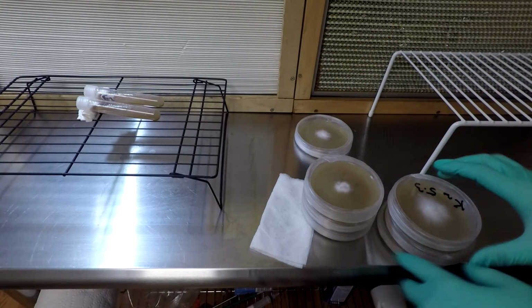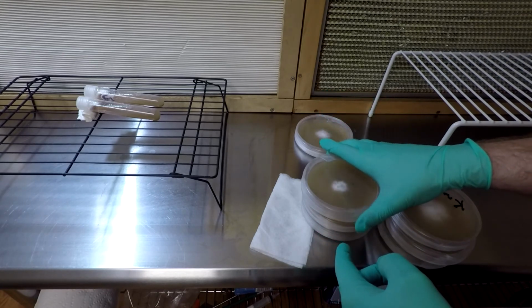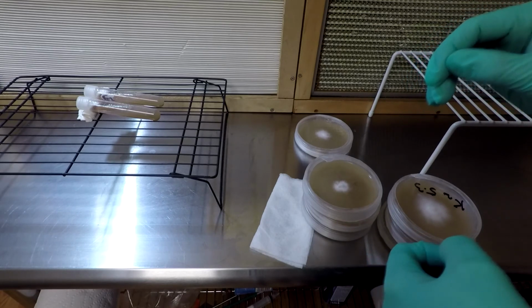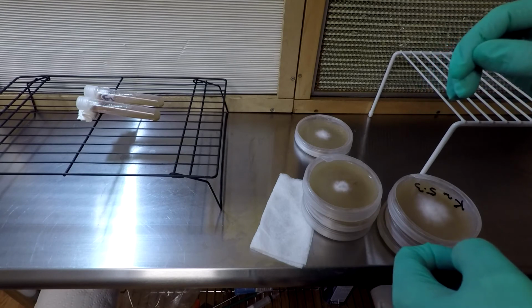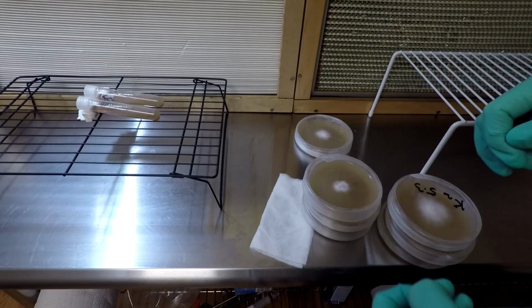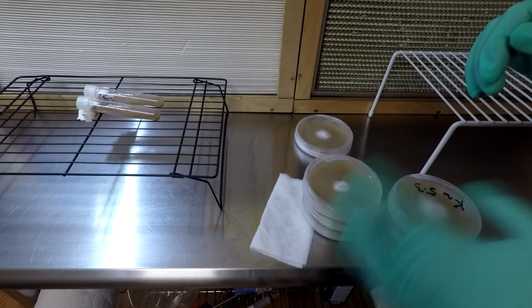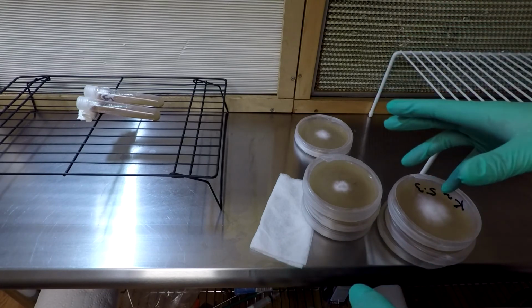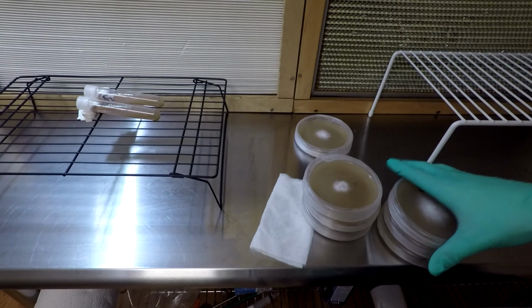But I'm going to try to keep track of the liquid cultures that I eventually make with these, and we'll see if they have different speeds of colonization, and maybe even different fruiting times, how fast they'll fruit off and how much they'll fruit. And my experience with oyster mushrooms in general is that even with isolates, you're going to end up with the same yield per time per food, pretty much, with oyster mushrooms.